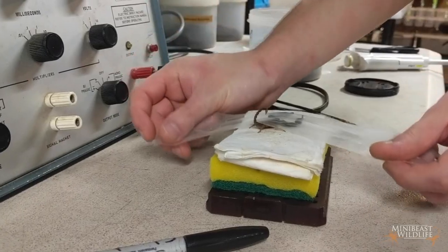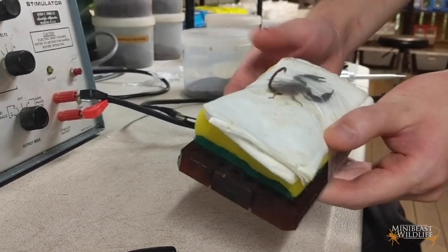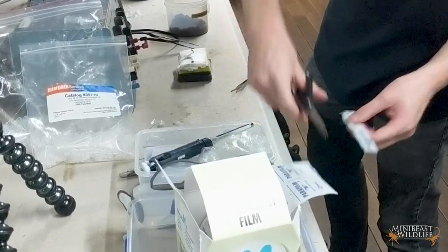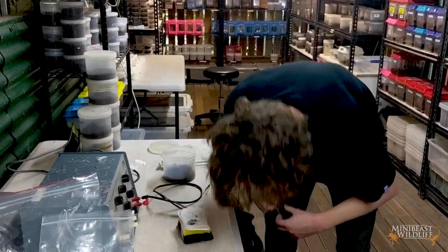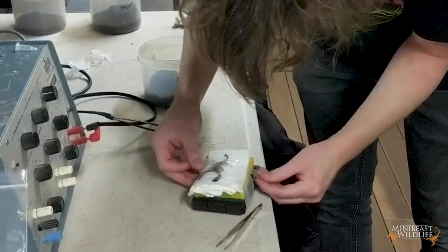So just lightly hold them down under this foam. This is more for the safety of the scorpion actually, rather than for us, because these aren't a particularly venomous species. But it's better if they can't really move around much — they're not going to hurt themselves.